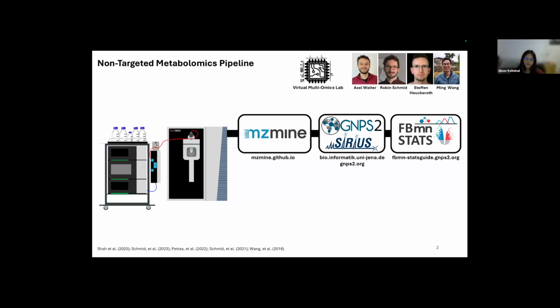So how we do that is we get our data from mass spectrometry, and we particularly use LC-MS/MS, tandem mass spec. Reza already talked about it.